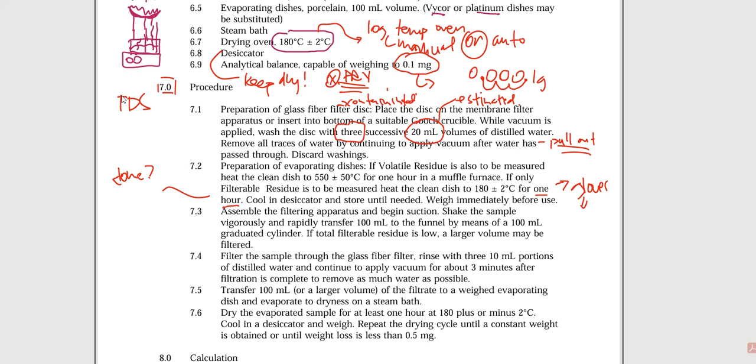So we don't want that to happen. So I'm going to say, please wear gloves, and please limit your contact with the dishes as much as possible, because anytime you're handling and anytime you're doing stuff with these, you have the chance of transferring all of that stuff over to those dishes.